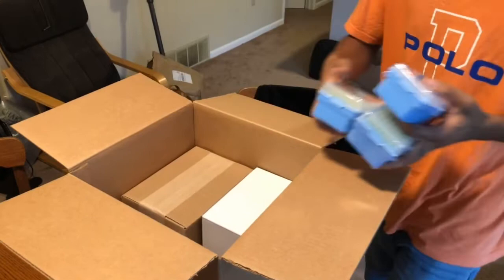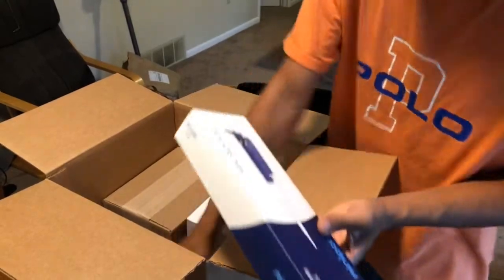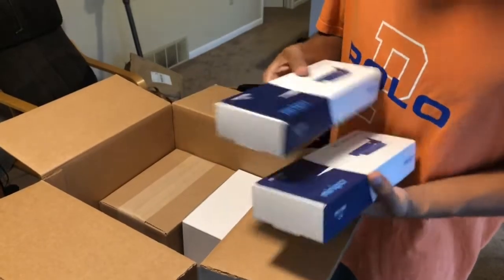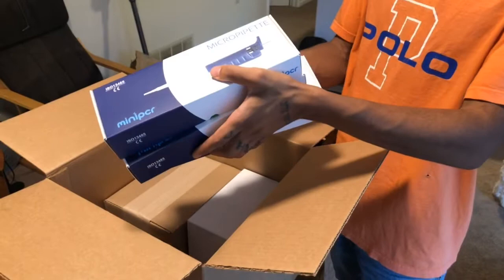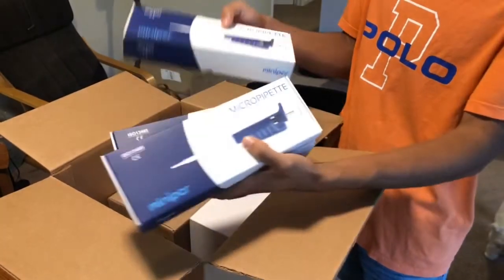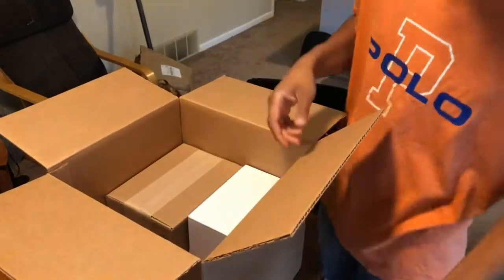Got a bunch of pipettes and pipette tips. I have one, two, three micro pipettes — they're all different sizes. We have the 2 to 20, the 0.5 to 10, and the 20 to 200.